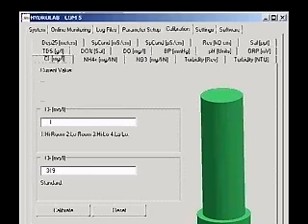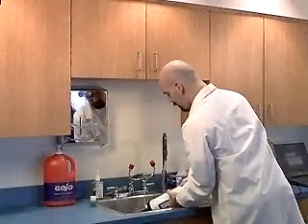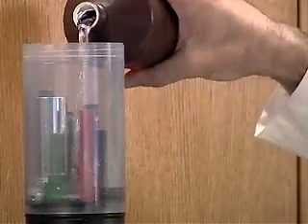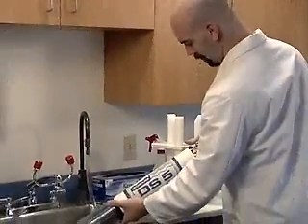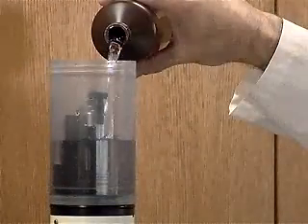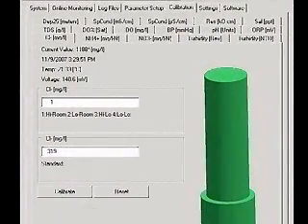You will see a picture of the probe as well as the current value, the date and time, the current temperature, and the voltage. Rinse and dry the sensors and attach the storage calibration cup. Fill the cup about 25% with the room temperature high standard and screw the storage cap on. Shake for six seconds. Remove the storage cap and pour the standard out. Fill the cup with room temperature high standard again, this time covering the ion tip and the pH sensor. Wait five minutes for the readings to stabilize.